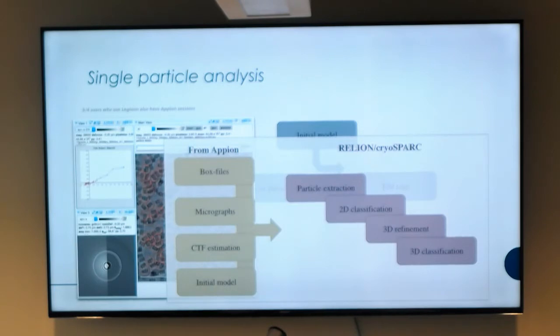You may be able to, or you may want to do that anyway, but if you're in a regime where you're collecting dozens of data sets, you want some feedback to say, how do I prioritize that? And you want initial models, and you want initial processing. Most likely what will happen is, if you have a data set of note that you want to work on, you'll be processing it many different ways in different packages for different purposes.